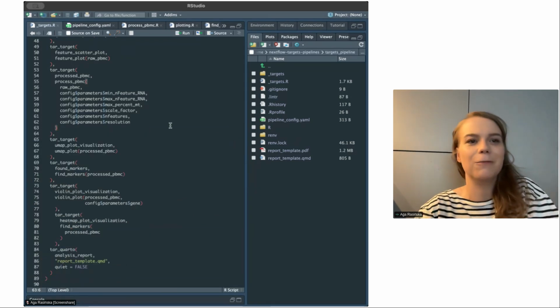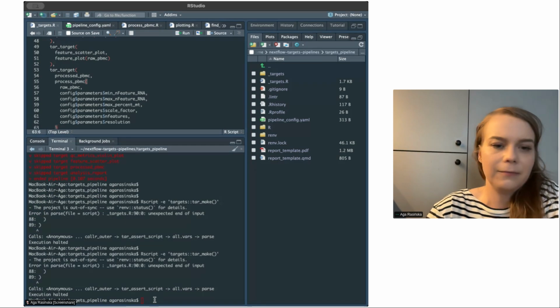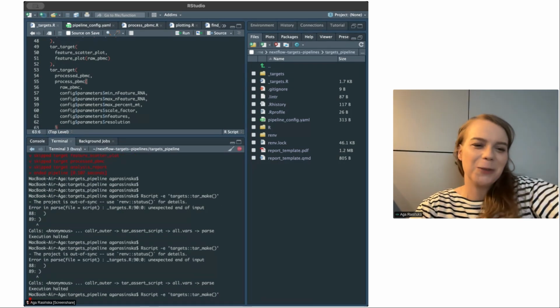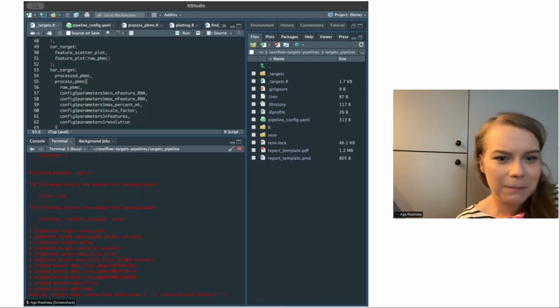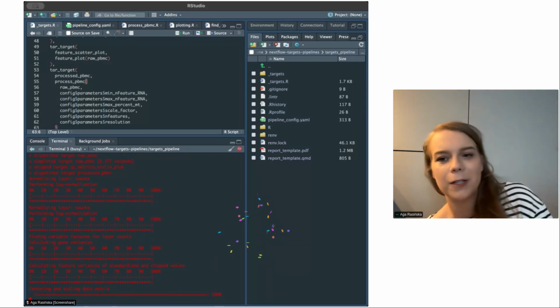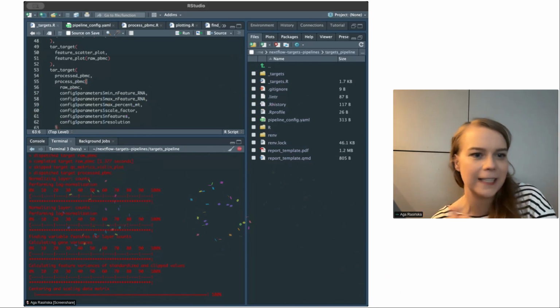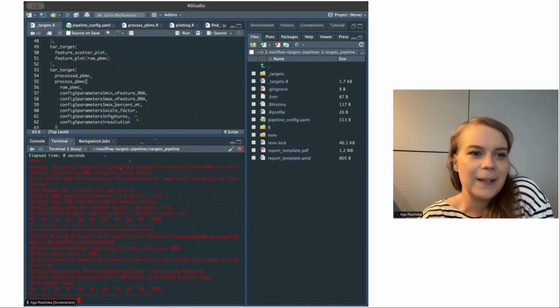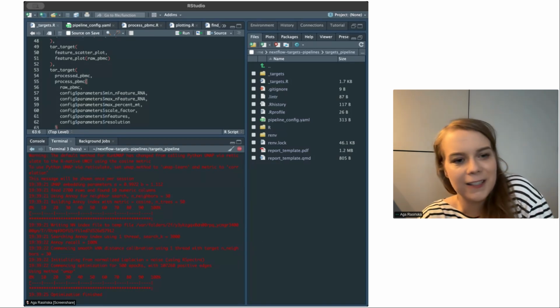Okay, saving will be good, right? Okay. Now, please do. Yes, it's going. I skipped some branches because they have already been done. You can see that we go with the processing, with normalization and calculation of PCA. Some UMAPs are going on, and using it to get the features in the class test.